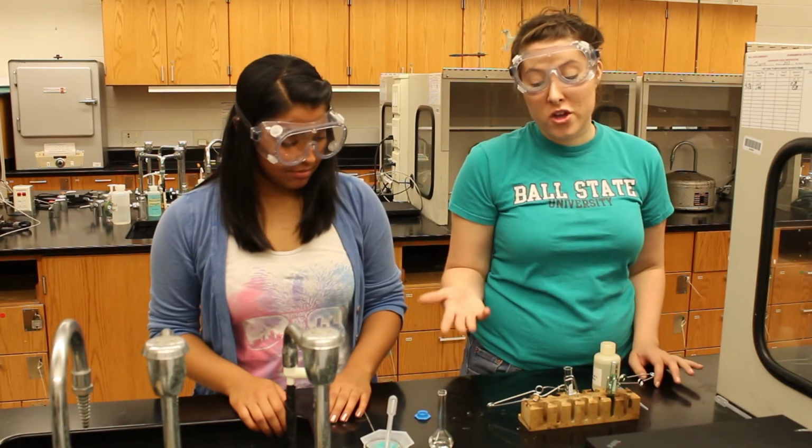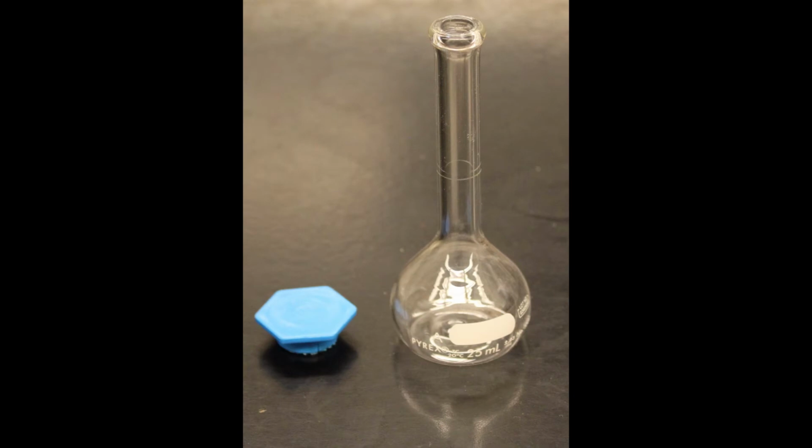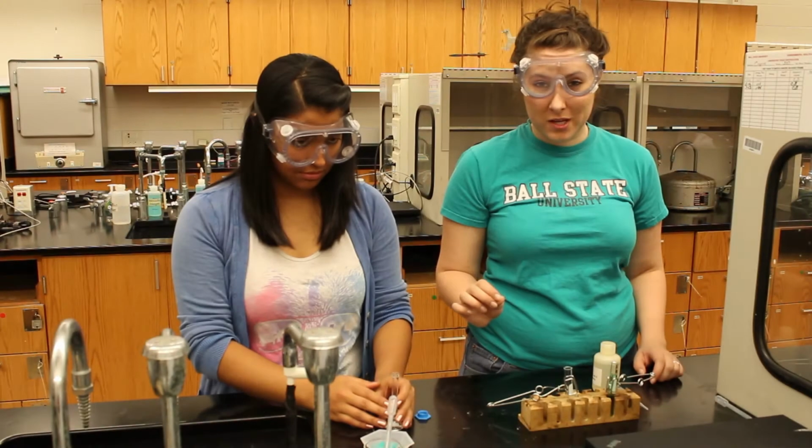Today we'll be using a volumetric flask. Now, volumetric flasks are very expensive because they're calibrated to accurately measure up to 2 decimal places.